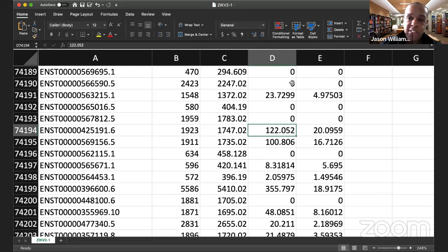And you'll notice that this is decimal. The reason for the decimal is because we did that bootstrapping where we sampled things multiple times so we get an idea based upon the variation of what the true number might have been. And the final thing next to it is this thing called TPM, transcripts per million mapped reads, and that's normalization, which we'll explain. But let me give you a quick explanation: if a transcript is really long, we expect that there are more reads just for the fact that it's a really long transcript. And a really tiny transcript that's short might not have that many reads, but it's also shorter. So you need to account for that effect. Basically, it's a normalization, so we can say that the count is actually 20.